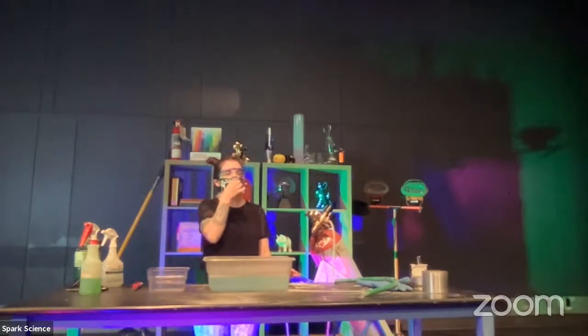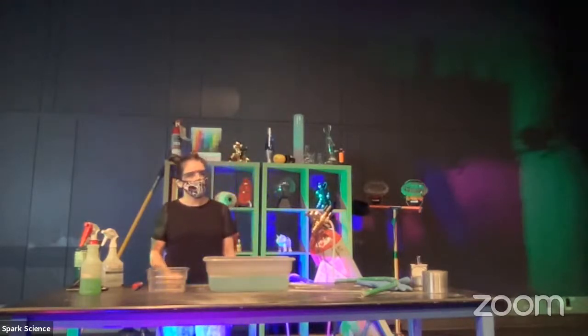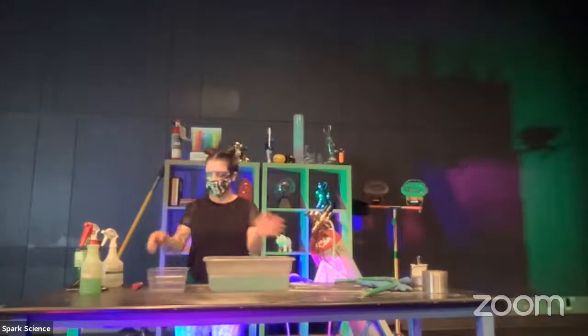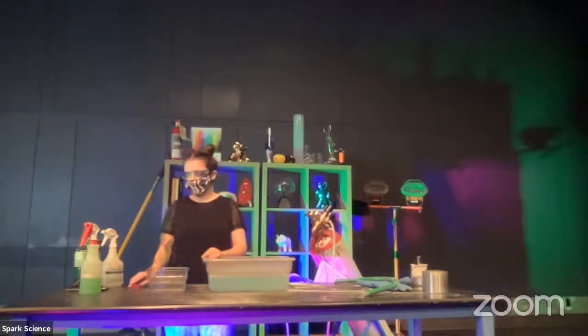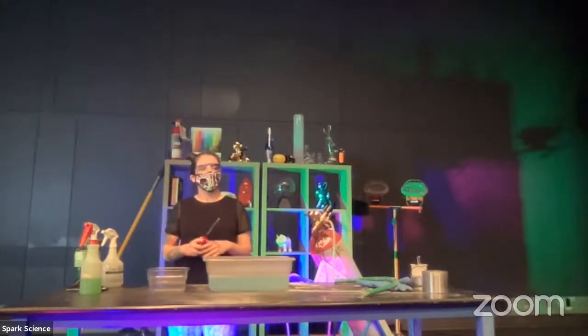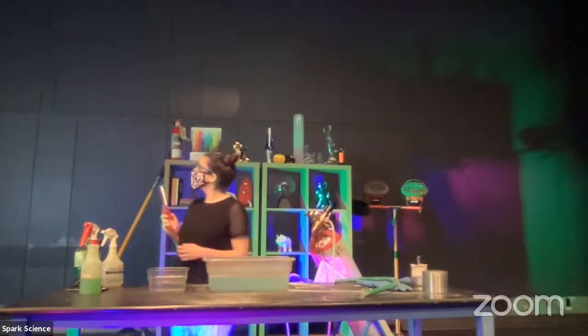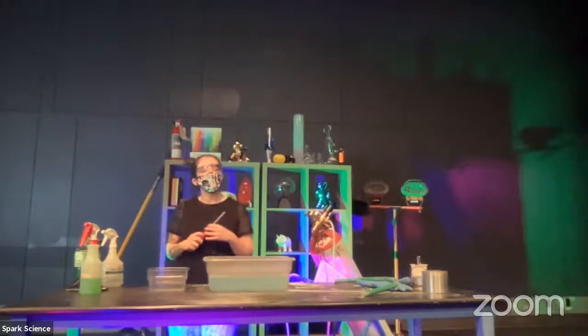You know what? Gases, we've explored paper, that's really flammable. We've explored flammable liquids, but we haven't explored flammable gases yet. Now, different gases can be flammable. And there are different types of gases found even on our sun that are really flammable. It's something called hydrogen gas. Hydrogen is very, very flammable. And we've got some balloons over here for you today.